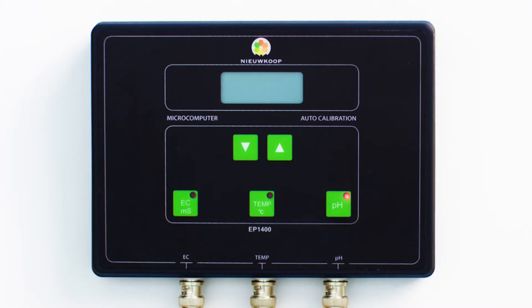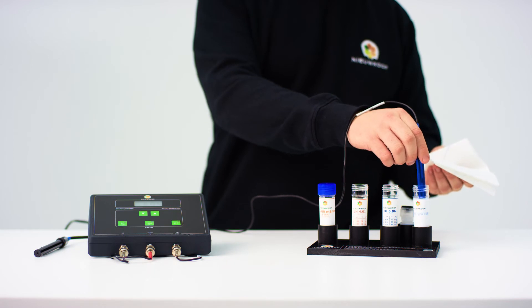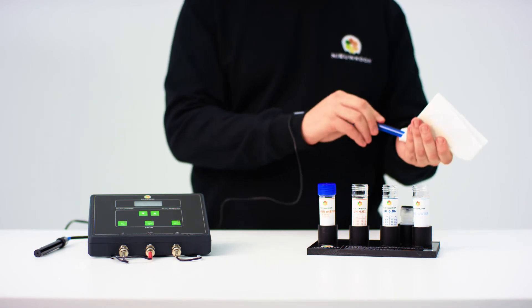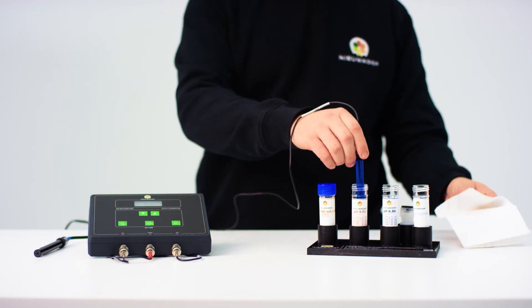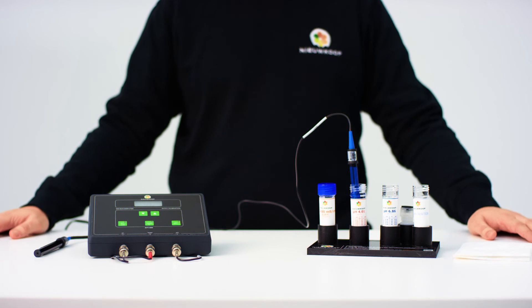When the tilde sign disappears and 6.88 is visible in the display, it means that the instrument has finished calibrating the first point. Press the pH key to confirm. The text 'pH 2' now appears on the screen. Once again, clean the sensor with demineralized water and dry it off. Again, do not touch the glass bulb. After drying, place the sensor in the pH 4.01 liquid. Stir briefly again to remove any air bubbles.